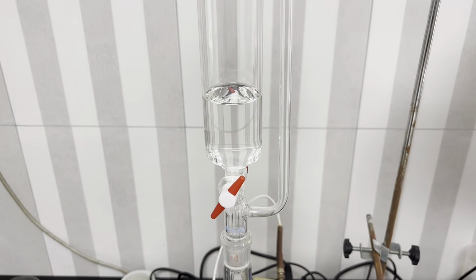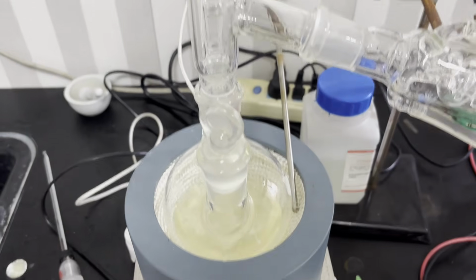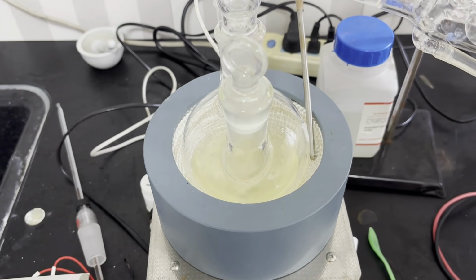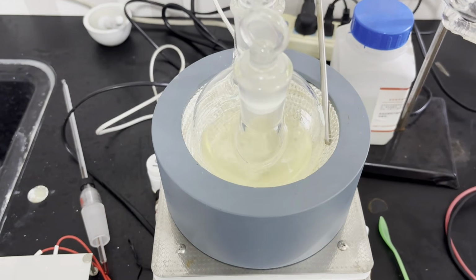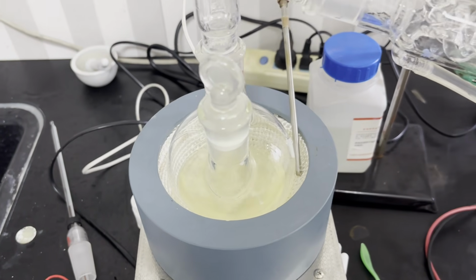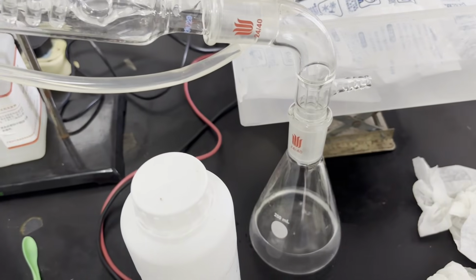But a difficult forward reaction implies an incredibly easy backward reaction to decompose diacetone alcohol back to acetone under a sodium hydroxide catalyst. And by continuously removing acetone from the system via distillation, the equilibrium constantly shifts to the acetone side, and eventually all diacetone alcohol is converted to acetone.